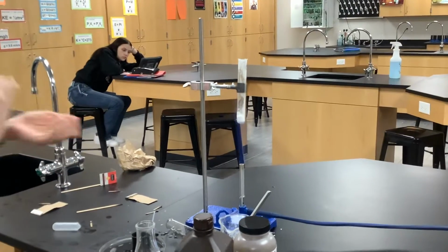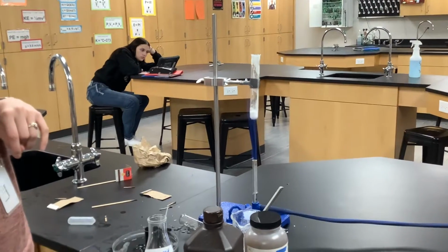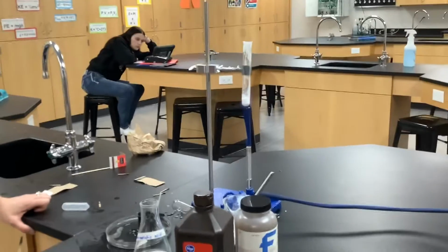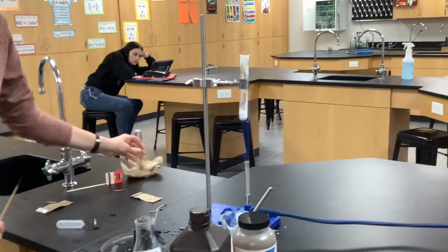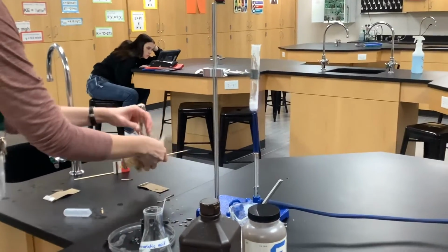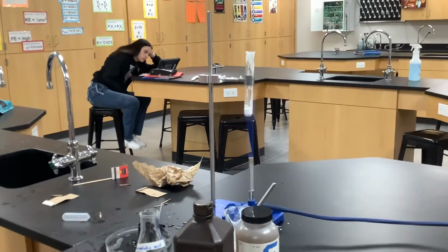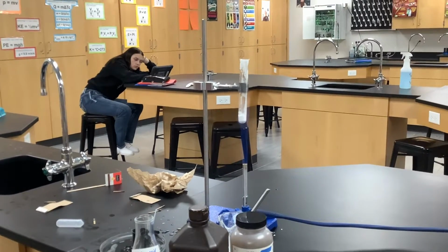And we're gonna give that a minute or two as it does the chemical reaction, because all it needs is a little bit of heat to get that going. We should see water too, because another one of the products is water.